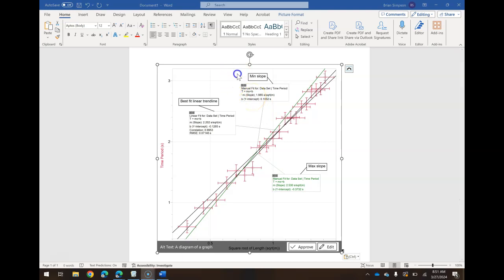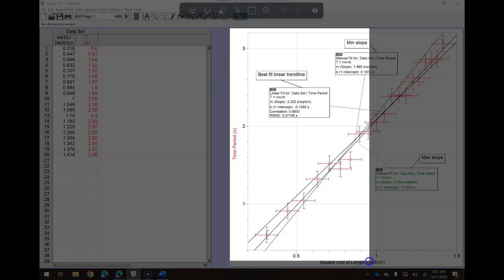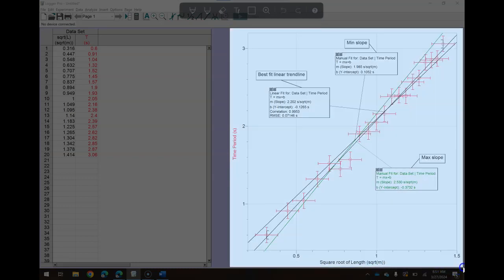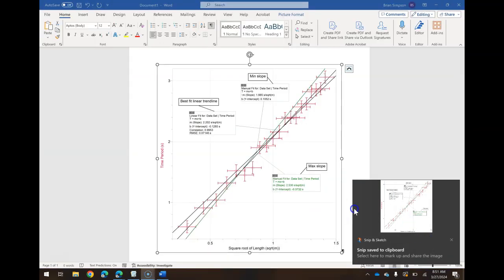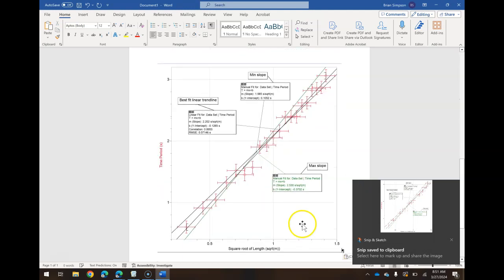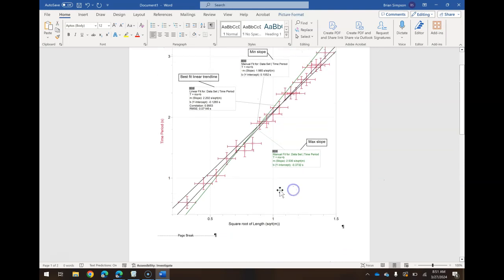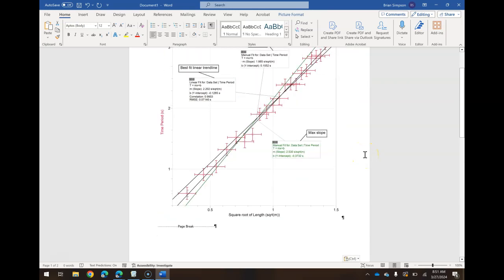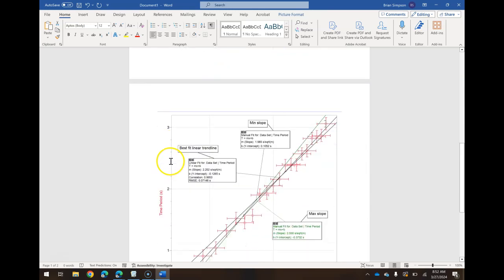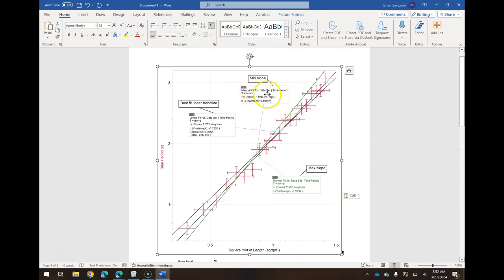You can just use a screenshot, I suppose. So on Windows, Command-Shift-S gives you the ability to take a screenshot. You'll probably get roughly the same results doing, let me see what this looks like. So here's my screenshot. Here's the copy and paste. I don't know if they're too different. The quality is about the same. It's legible either way. I did accidentally capture extra stuff on the outside, so if you're going to do a screenshot, make sure it looks nice. Copying it, I think, is the best way.